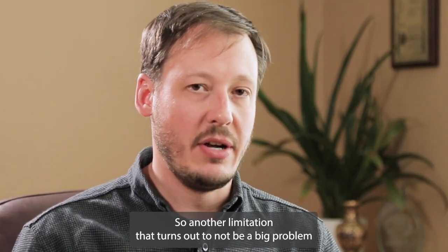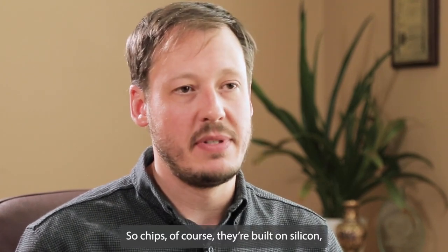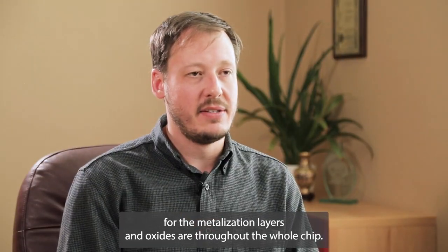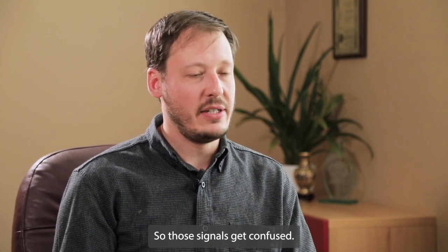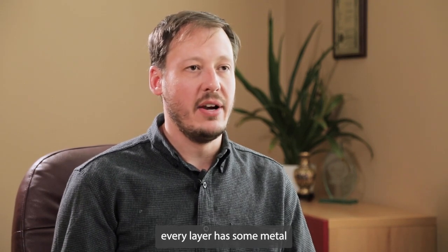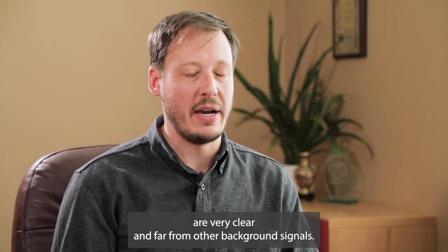So another limitation that turns out to not be a big problem is that you can't really monitor the signal of silicon or oxygen. So chips, of course, they're built on silicon. Silicon oxide is the primarily used insulator for the metallization layers, and oxides are throughout the whole chip. And the problem with monitoring silicon is that the mass is the same as N2. And for oxygen, there's always background oxygen. So those signals get confused. However, this ends up not being a problem in practice because every layer has some metal that you can monitor. And metal signals are very clear and far from other background signals.